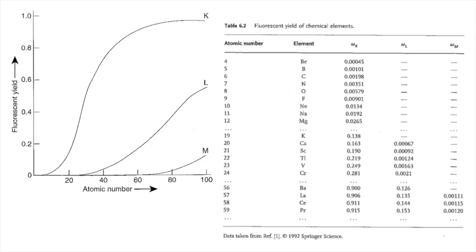And so we can't use these X-ray spectroscopy techniques to look at lithium in these ways, since the amounts are so low. And really, if we get all the way up to oxygen, the yield is very low for those, so quantification can be difficult.